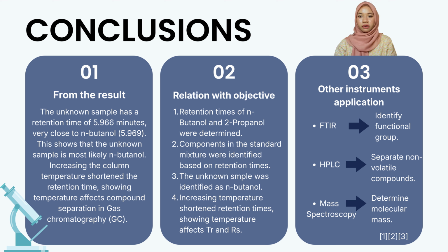The retention times of N-butanol and 2-propanol were determined using gas chromatography, fulfilling the objective of understanding compound separation based on retention time. The components in the standard mixture were identified by comparing their retention times, which demonstrates the effectiveness of gas chromatography for qualitative analysis.